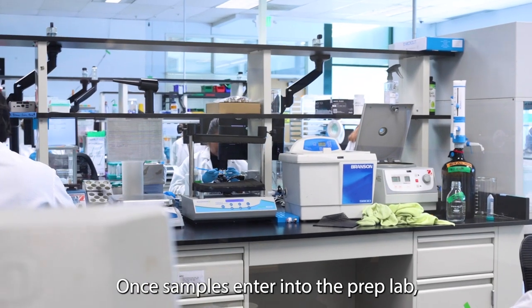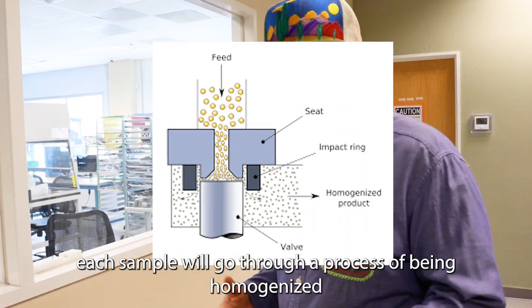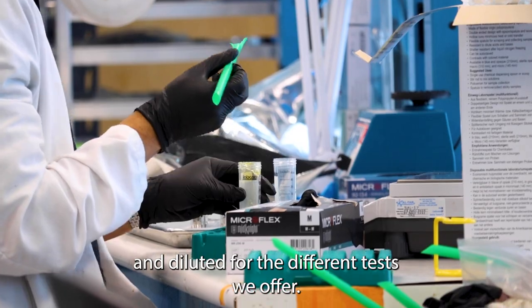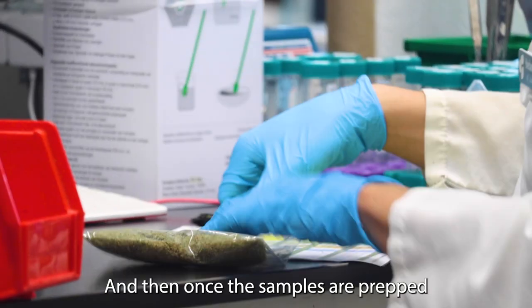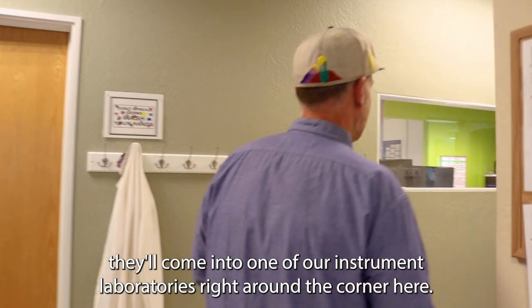This is our prep lab. Once samples enter into the prep lab, each sample will go through a process of being homogenized and then separated out to be extracted and diluted for the different tests we offer. Prep is really the major work that happens in this laboratory. Once samples are prepped, they'll come into one of our instrument laboratories right around the corner here.